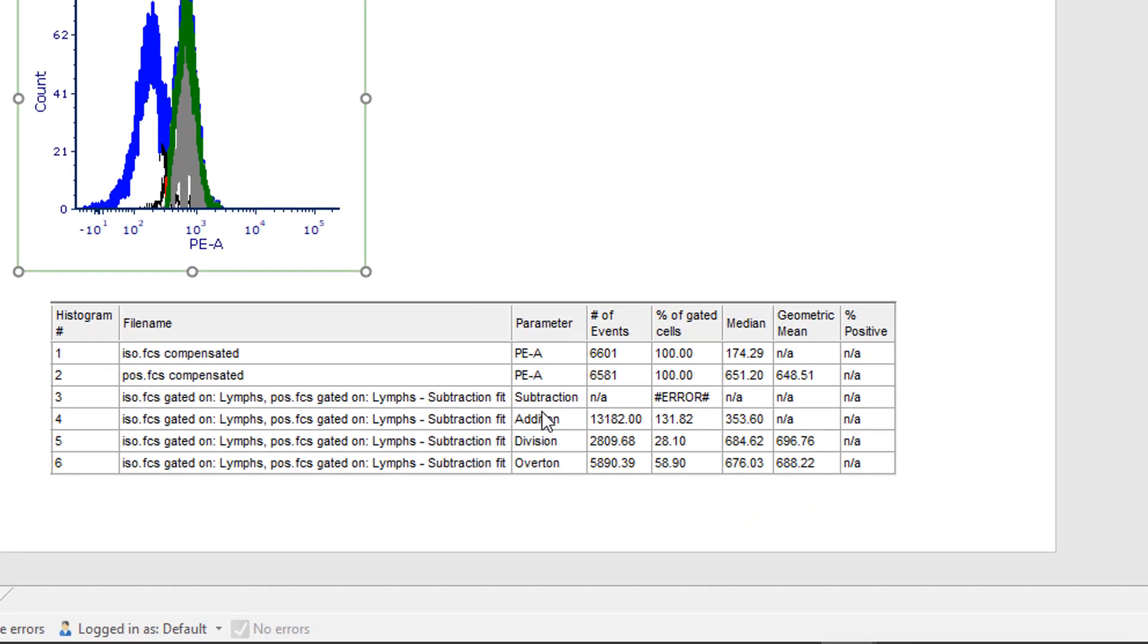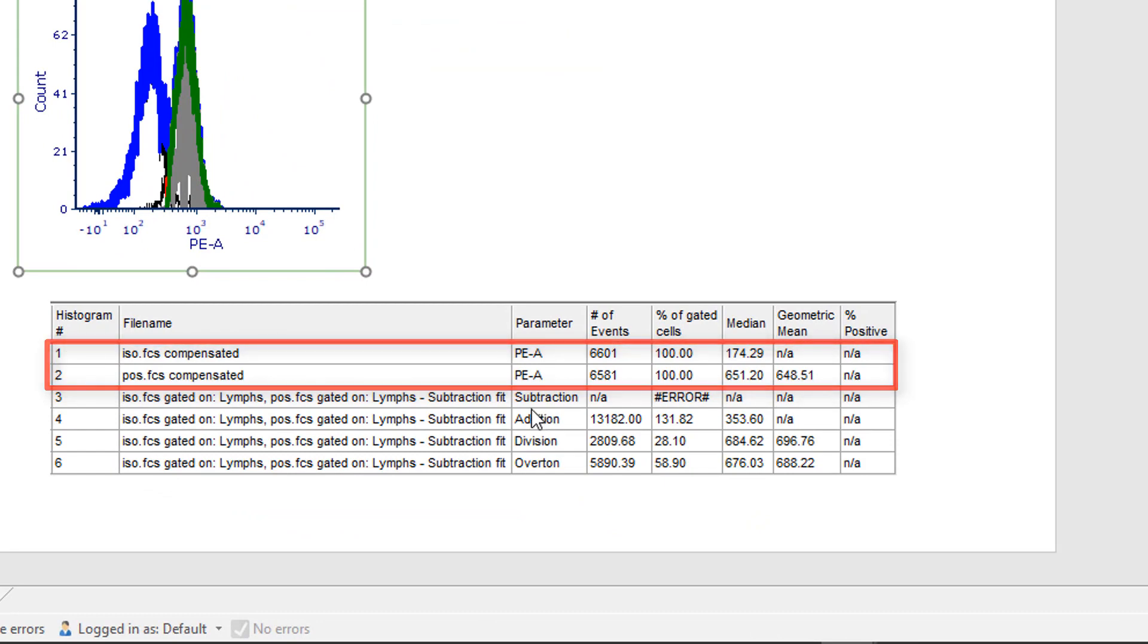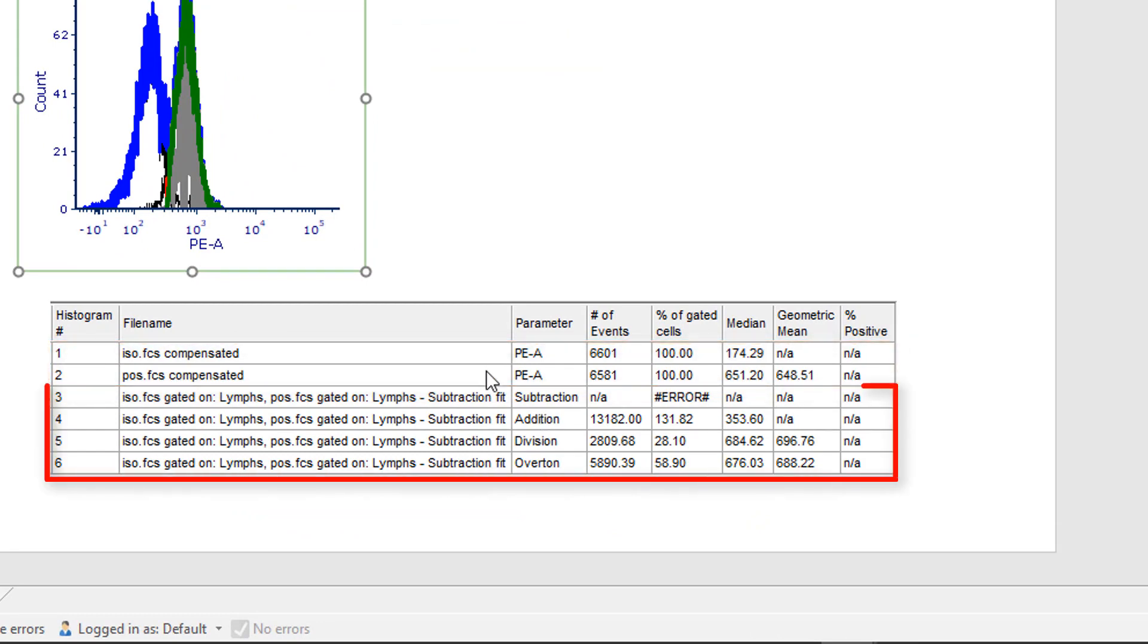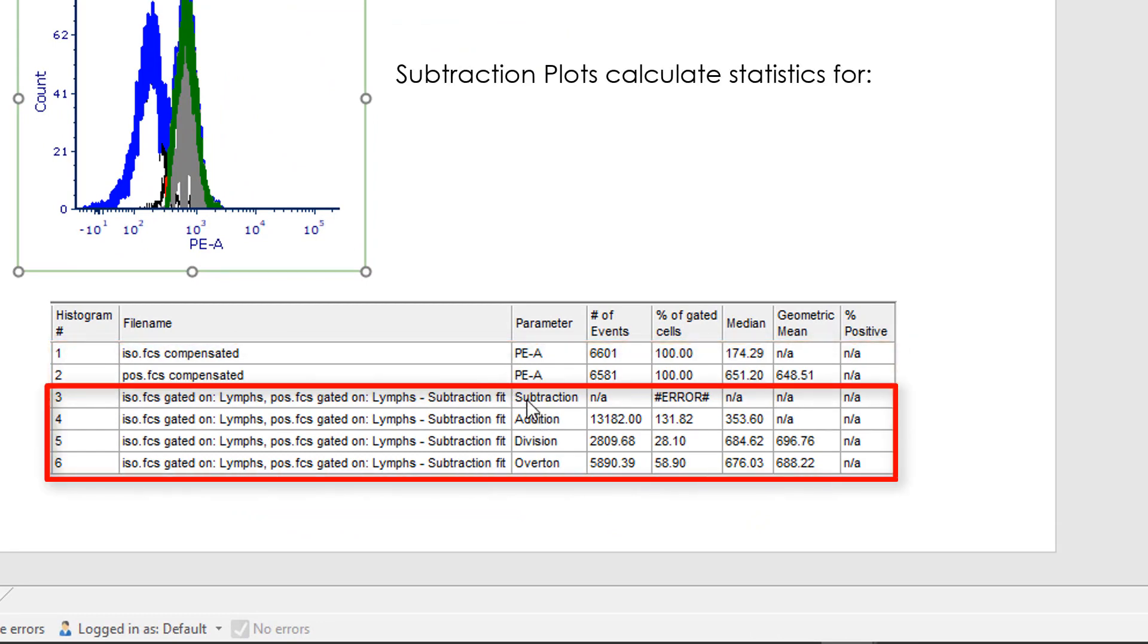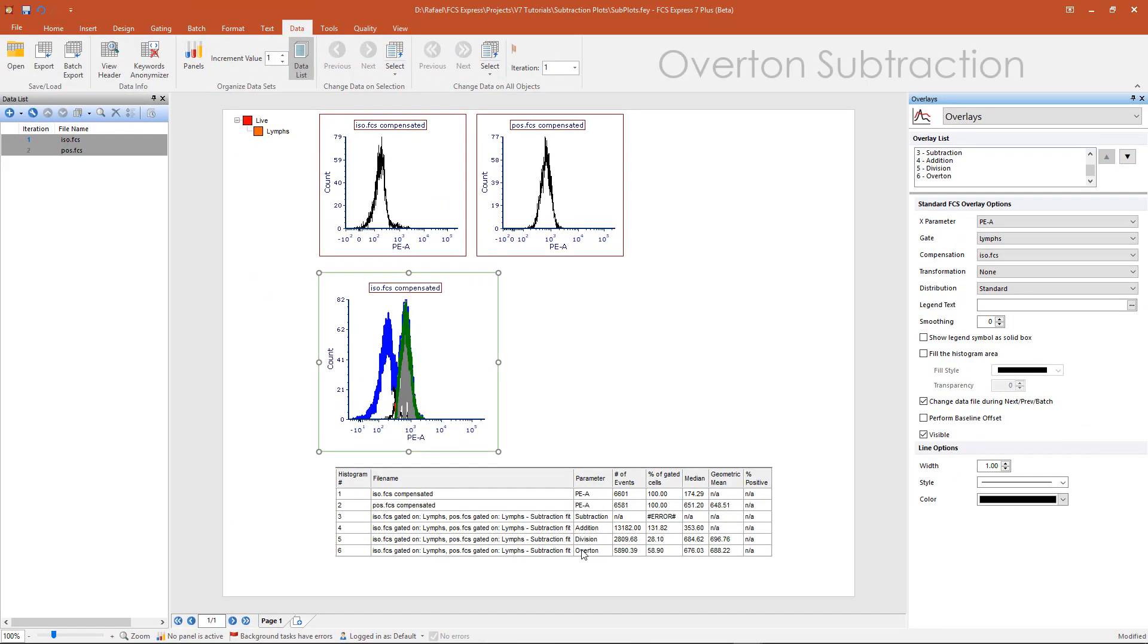In addition to the two source overlays defined by the user, there are four additional overlays for subtraction, addition, division, and overton.